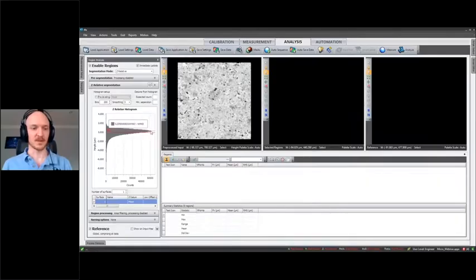So in this case, we're working off of a histogram of height points in the map. And then what we'll want to do for our Z relative technique is define a height range to segment our data. So I'll expand this slightly.